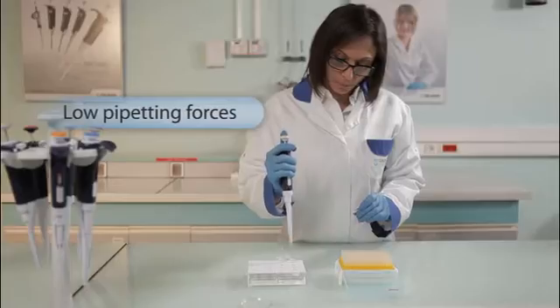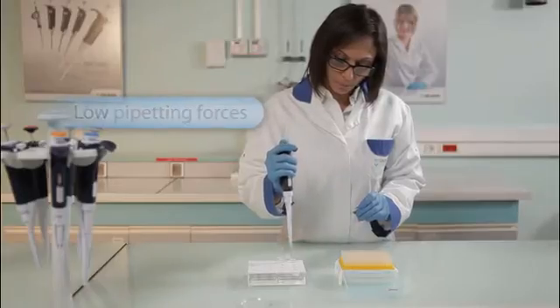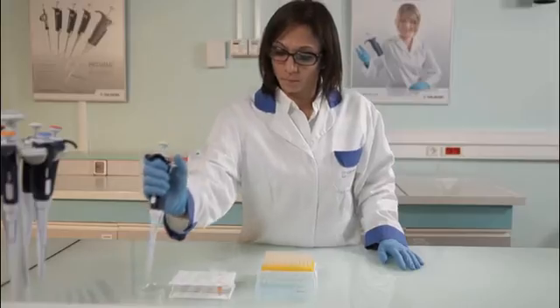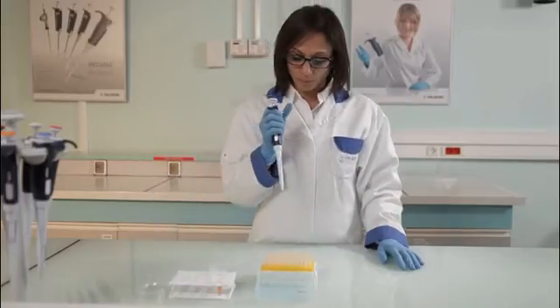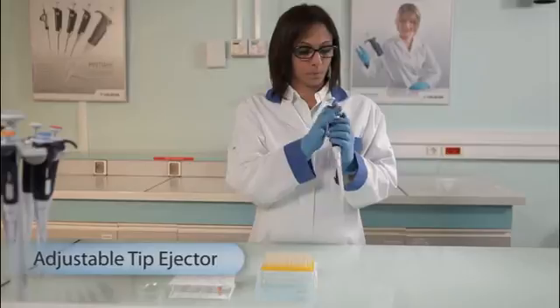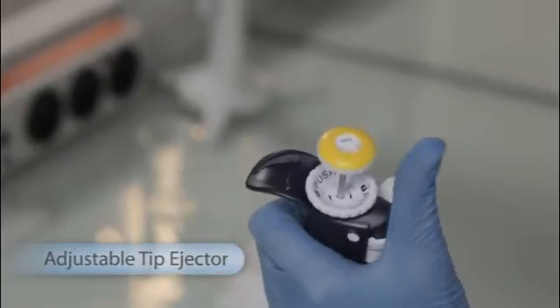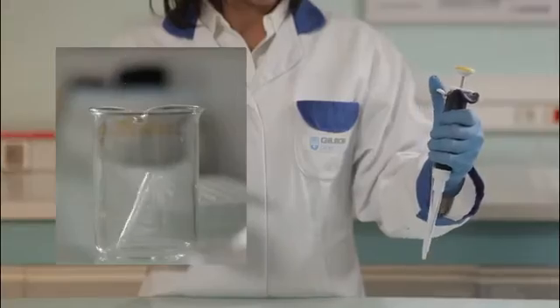In addition to extremely low pipetting forces, the tip ejection has never been so easy and comfortable. With a unique tip ejection button, both left and right hand users can enjoy PipetMan L ergonomics.